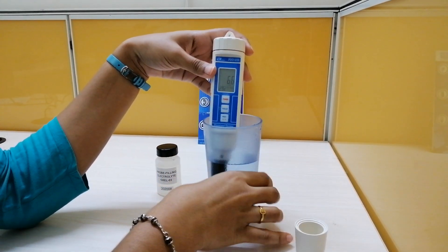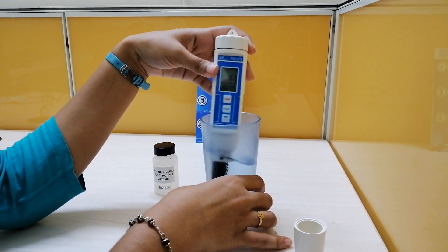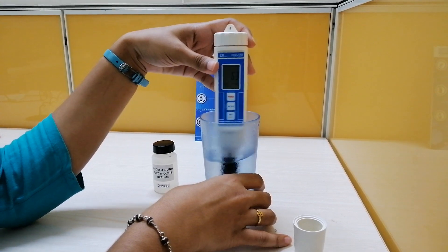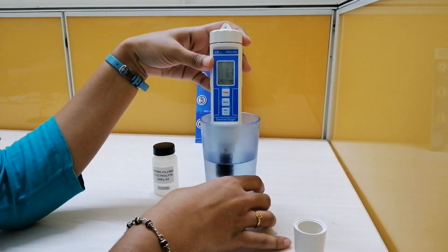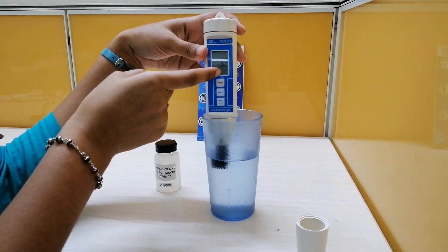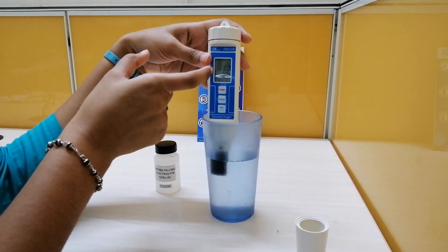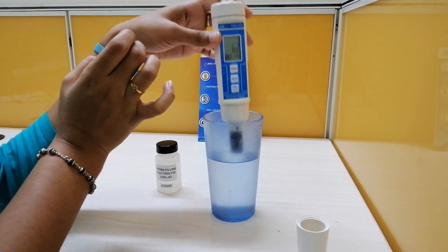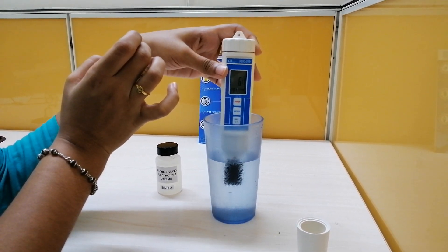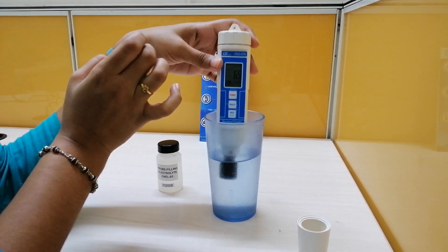You can get the value of dissolved oxygen in this. The dissolved oxygen value is 6.8, 6.7, which is fluctuating right now — around 6.3. You can see the reading in milligrams per litre along with the temperature. This is how we measure dissolved oxygen.